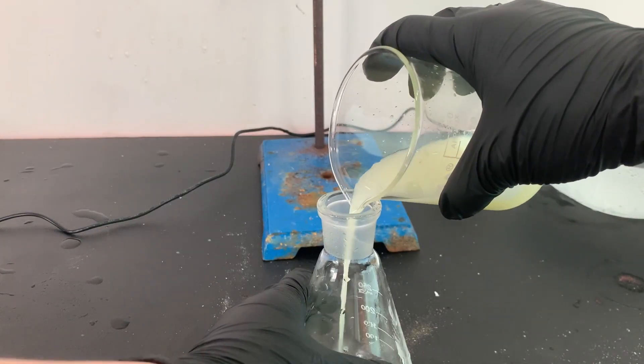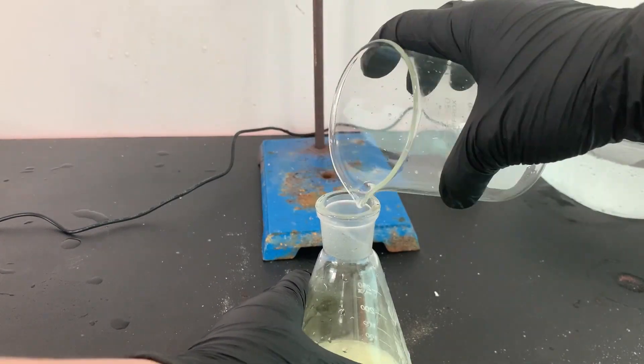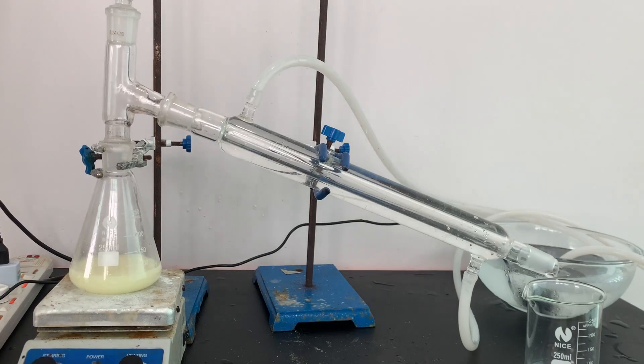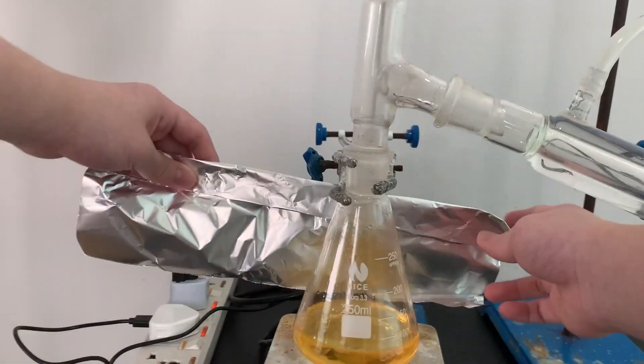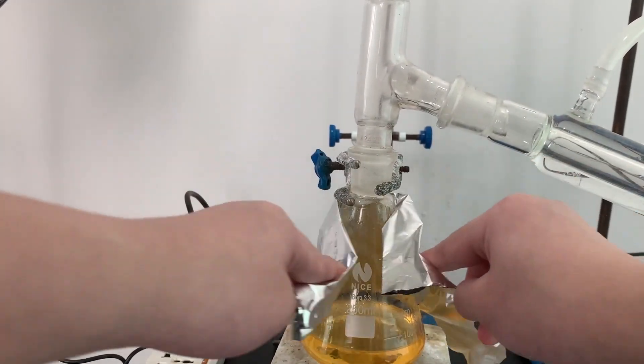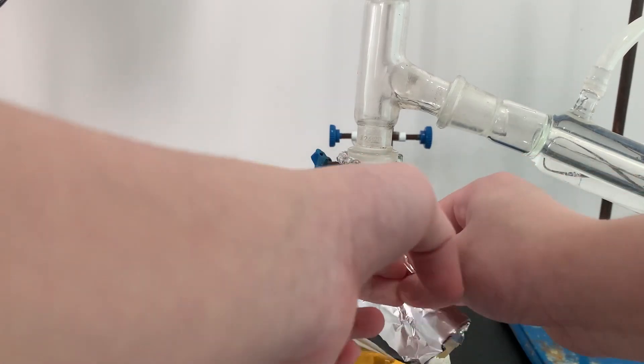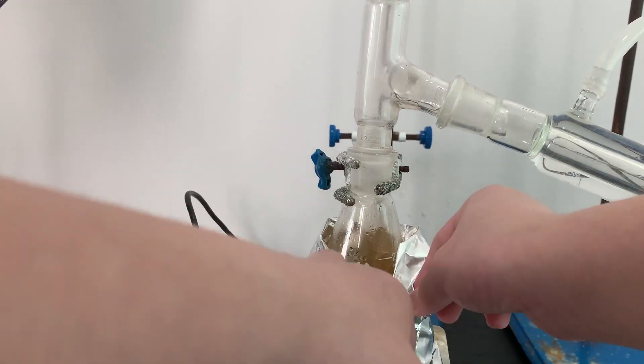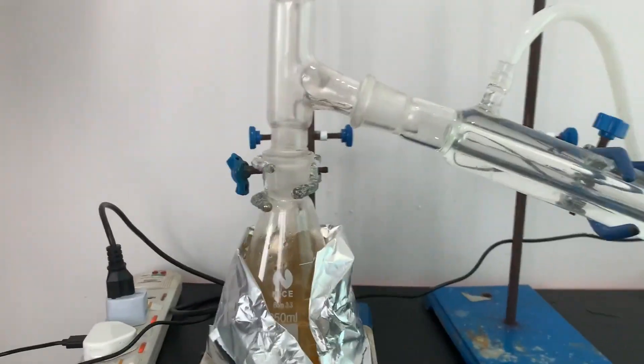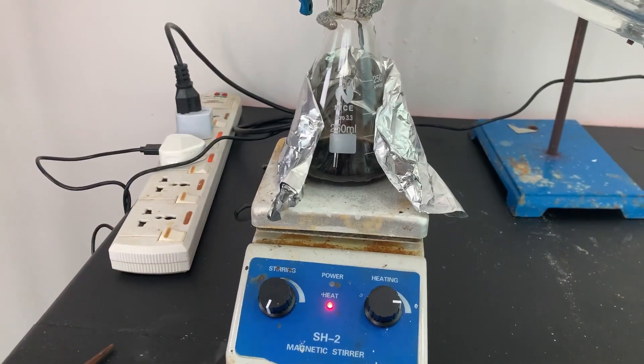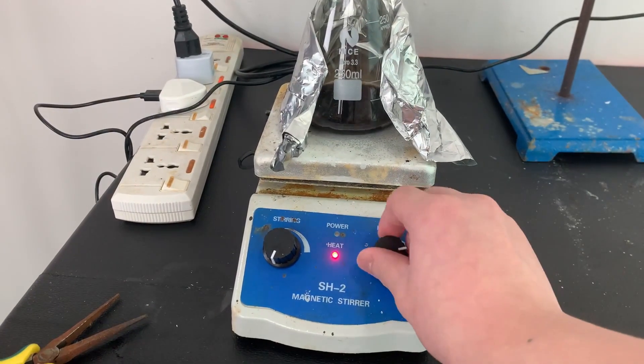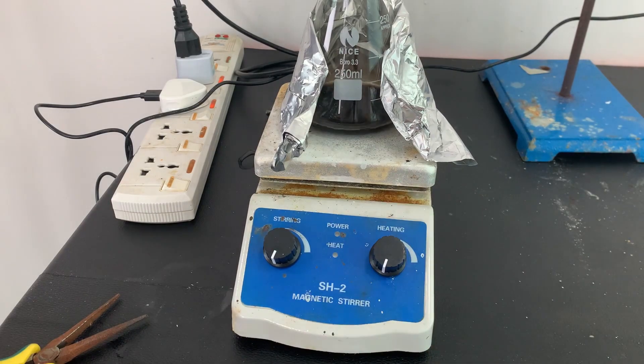The washed nitrobenzene was then poured into a jointed flask and set up for a simple distillation. The jointed flask was wrapped in aluminum foil to help insulate the heat and increase the rate of distillation. Once there was a small amount of liquid in the jointed flask, the heat was turned off.